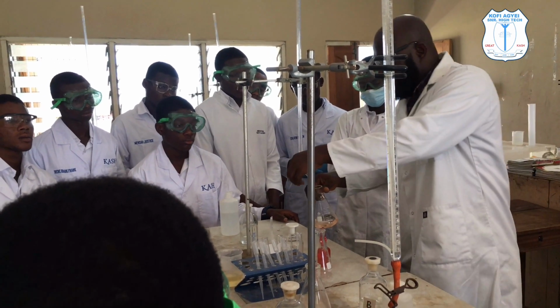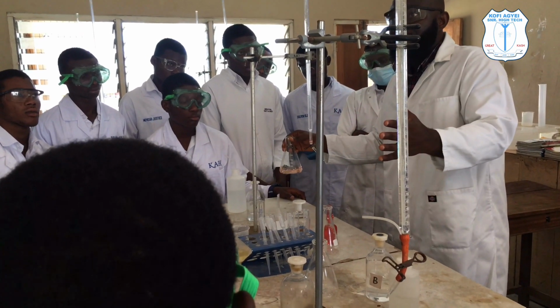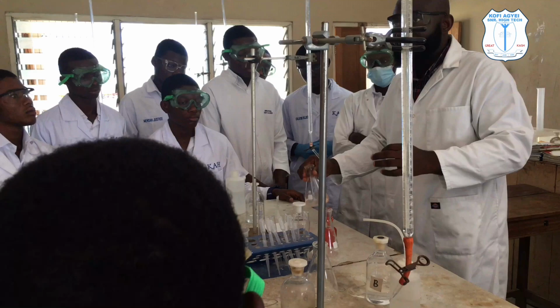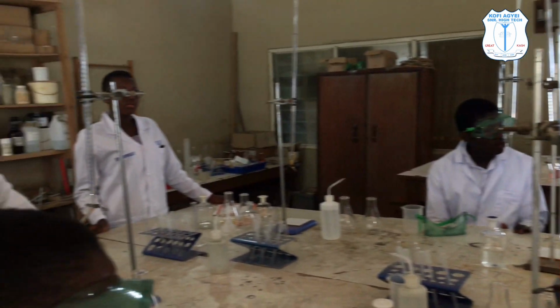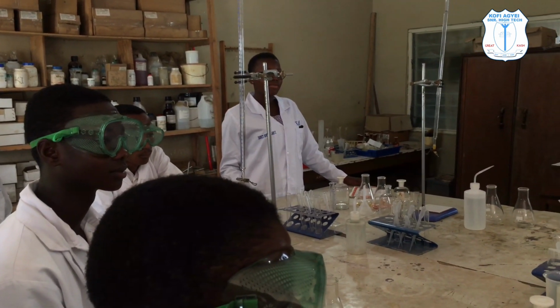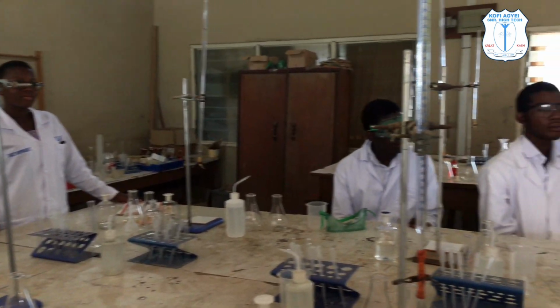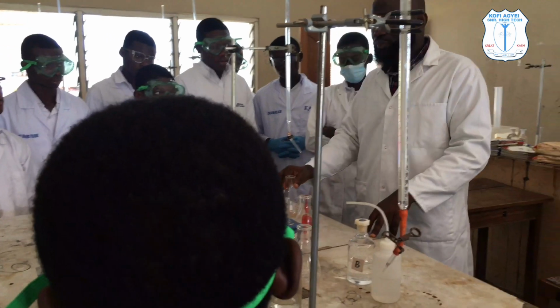Now, if you allow the acid to flow into this one without swirling, there wouldn't be any chemical reaction. Do you get it? So once you swirl it gently, it speeds up the rate of the chemical reaction. Now, the principle of titration: you swirl. Understood? Any questions?